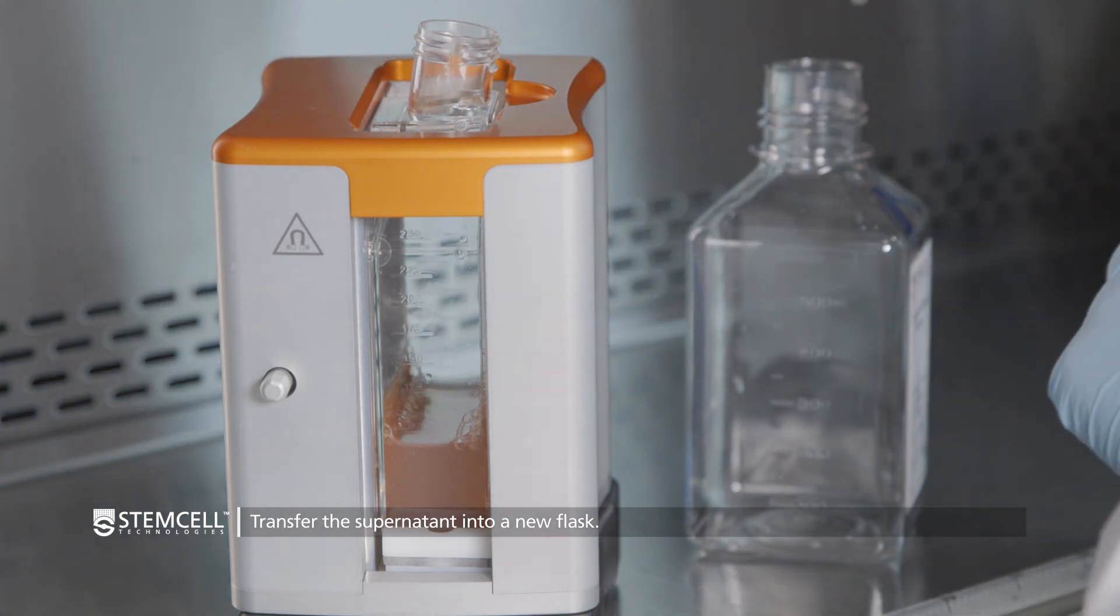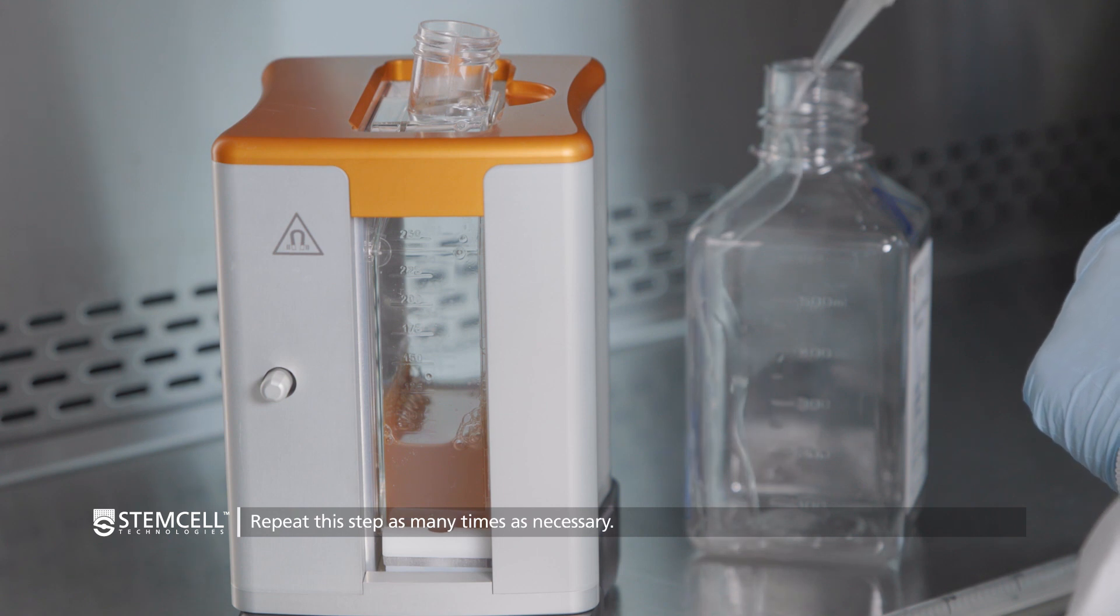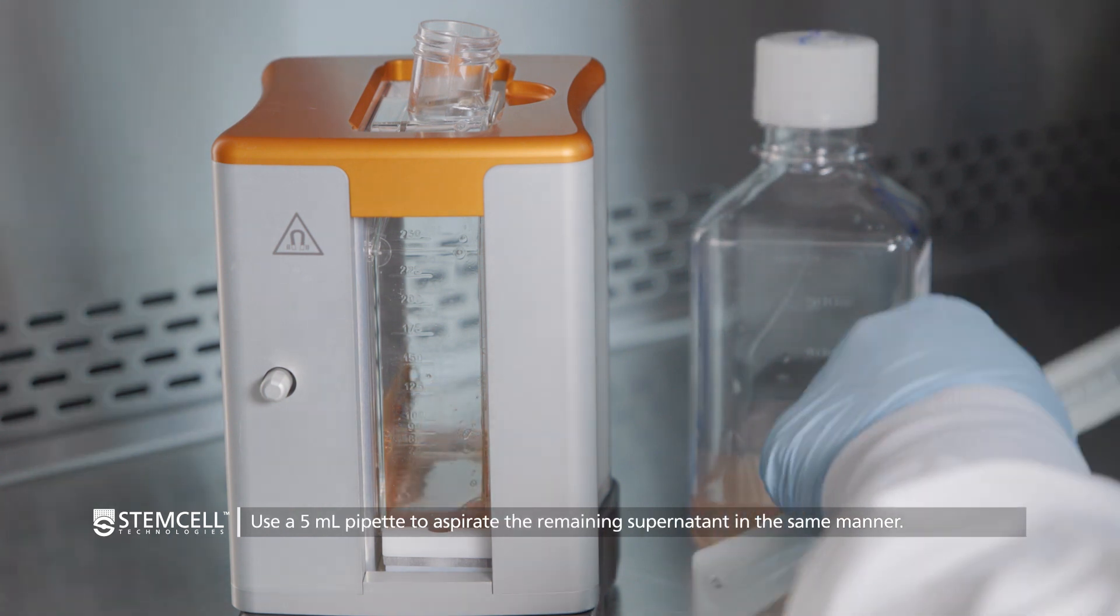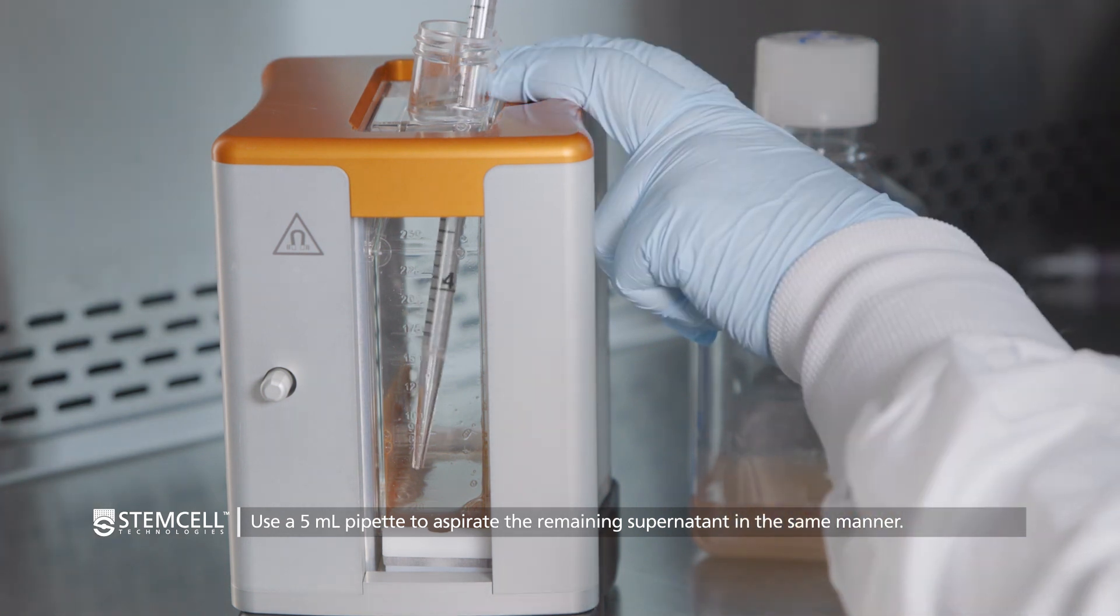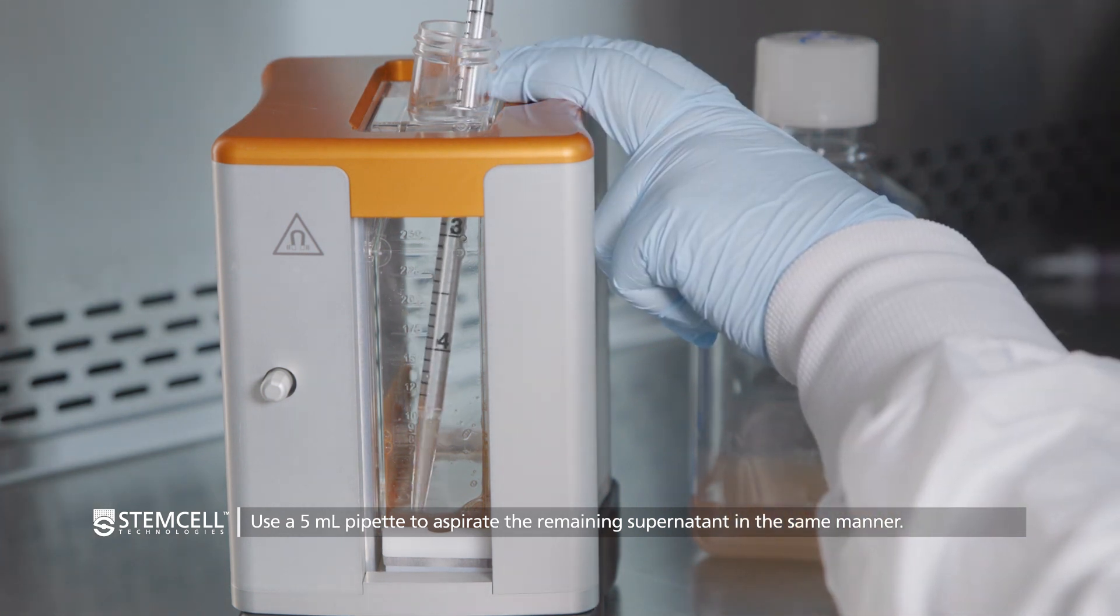Then, release the supernatant into a new flask. Repeat the step as many times as necessary. Once you have taken out the bulk of the volume, you can use a 5ml pipette to aspirate the remaining supernatant in the same manner.